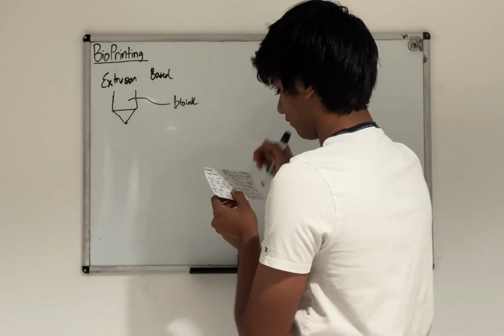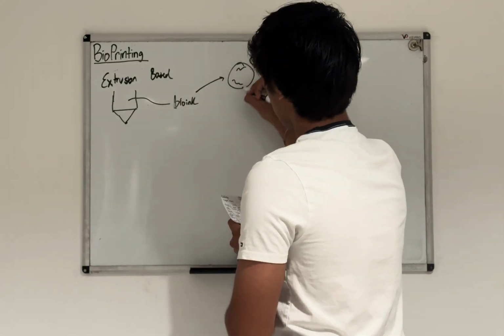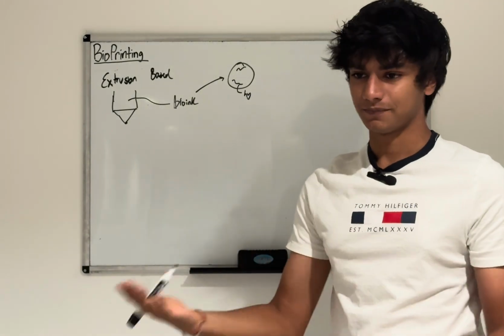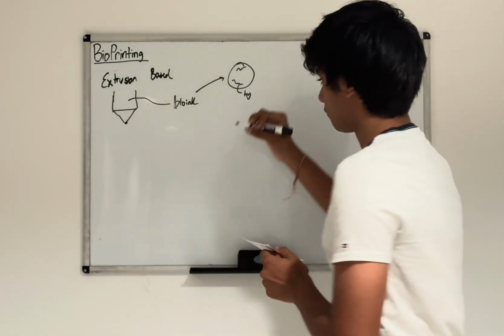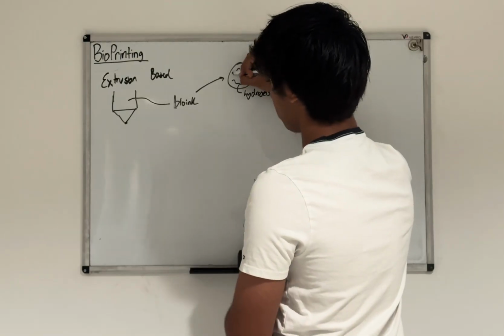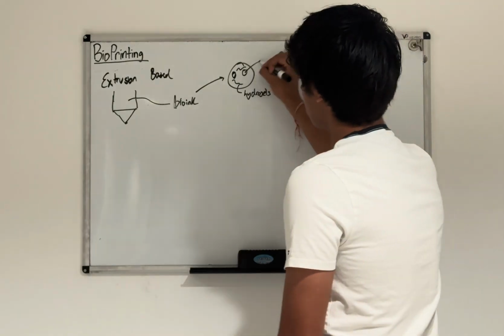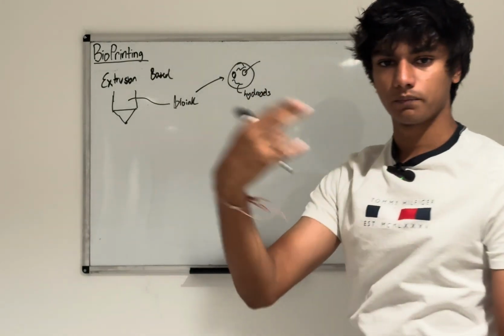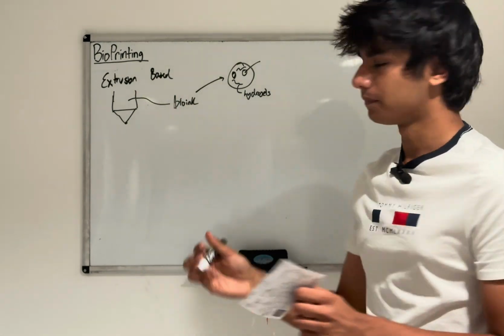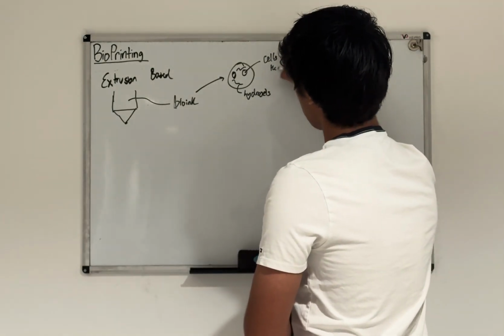If we look at bioink closer, it's made out of hydrogels. These hydrogels allow the structure to be supported and stand up on its own. So it has hydrogels and also, obviously, living cells. The interesting part about these living cells is that they can be taken from the actual patient who needs the transplant or the organ.